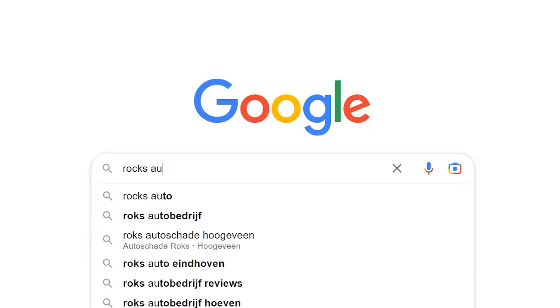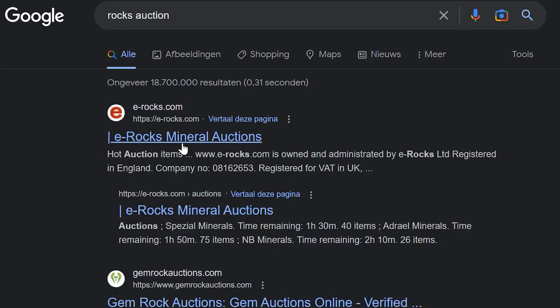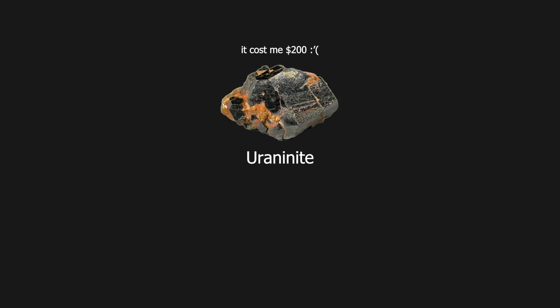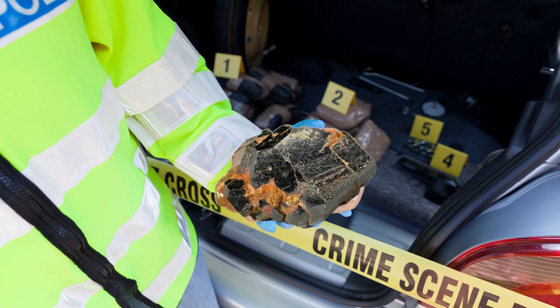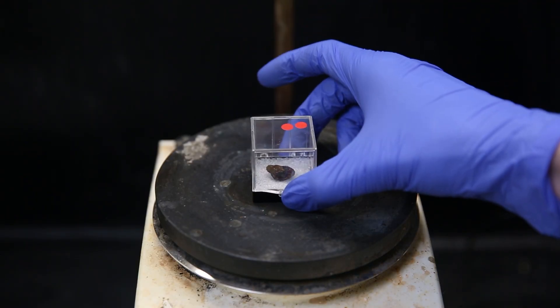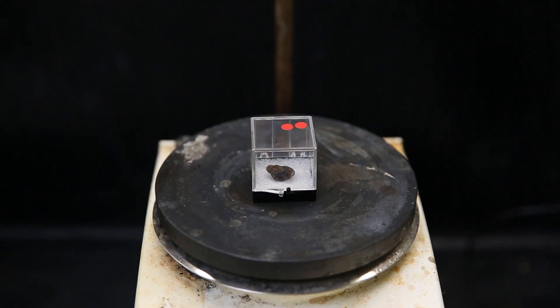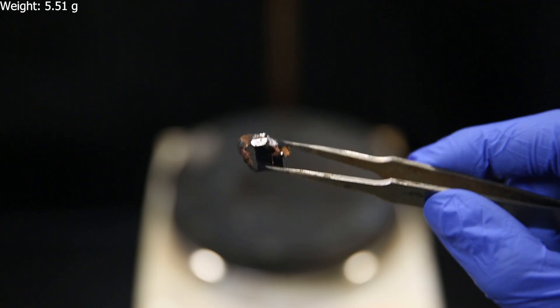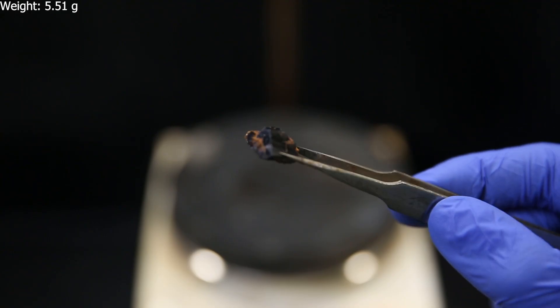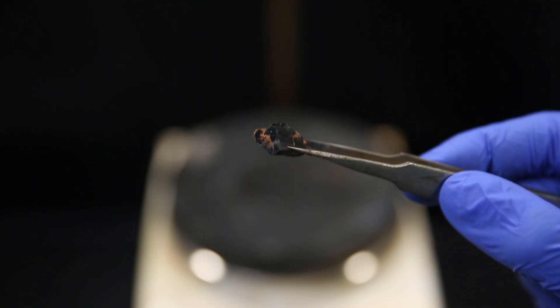So to buy my rock I went online and bought a small rock that contains mostly uraninite, which is uranium dioxide and partially tri-uranium octoxide. So after it was very surprisingly held at customs for almost a month I received it in good condition. It is quite small but it should contain enough uranium for my project. The total weight of the rock is 5.51 grams and it seems to be mostly pure uraninite, which is the black part.